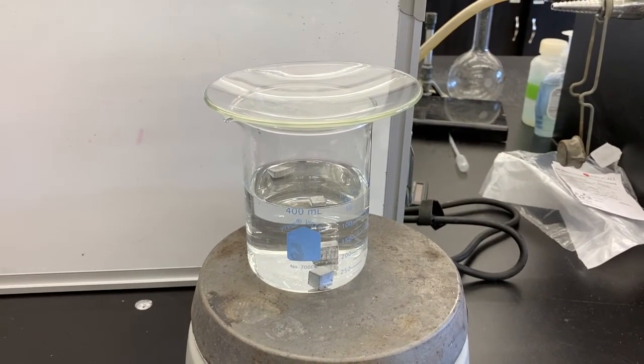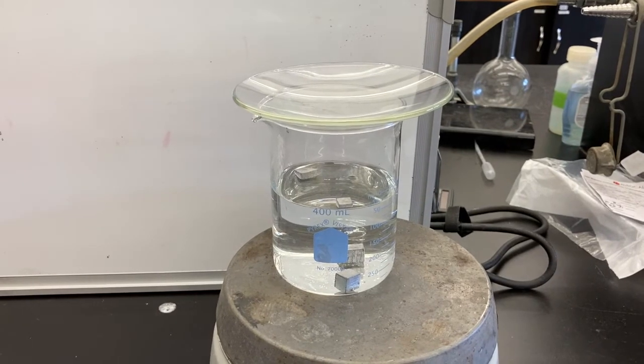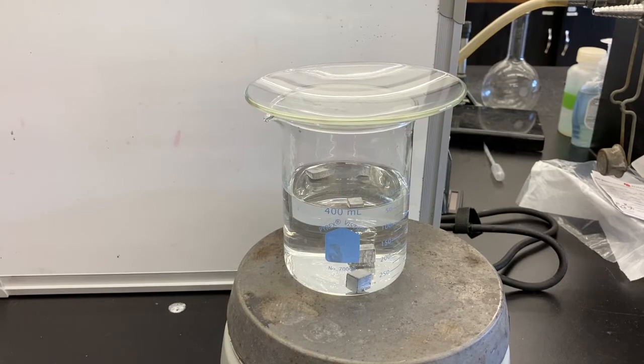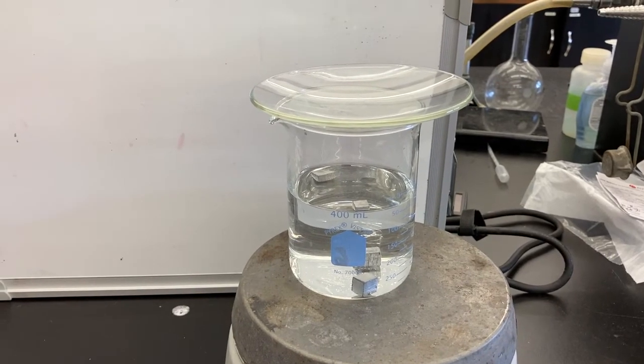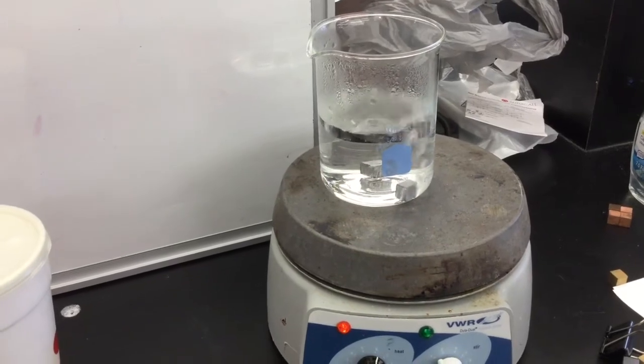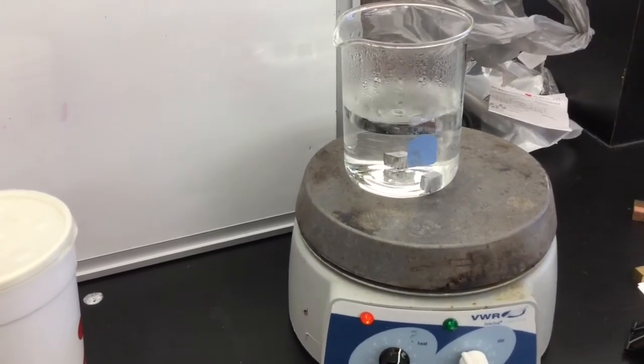It can be helpful to add a watch glass to the top of a beaker to help the heat stay within the beaker and to get the boiling process to occur more rapidly. It may take 10 minutes or so for the water to begin boiling and then you need to let it boil for another 10 minutes.